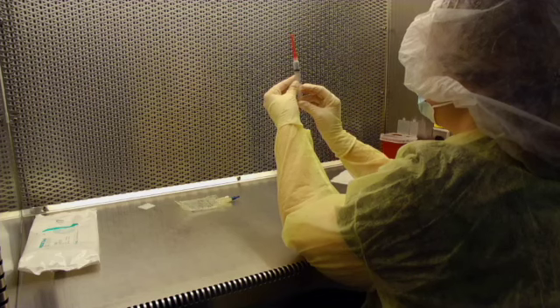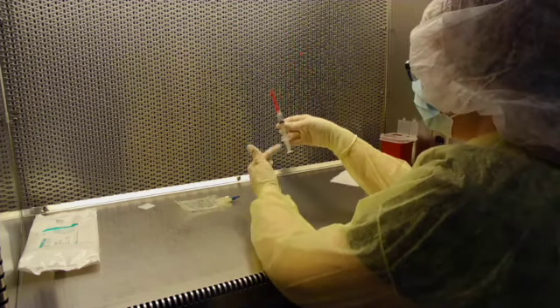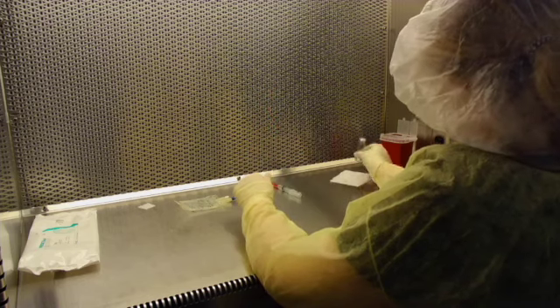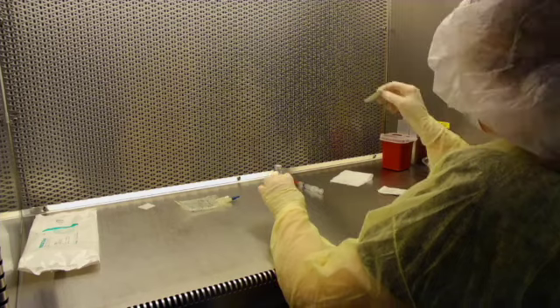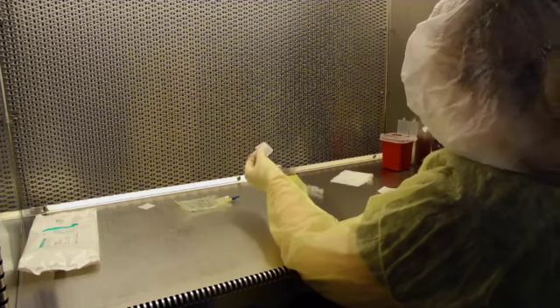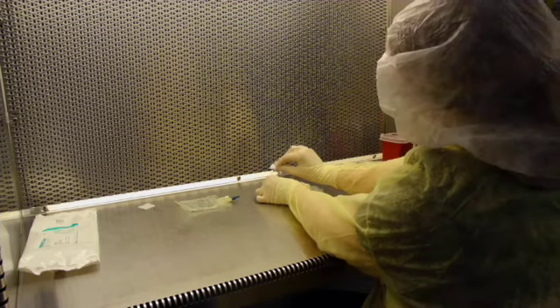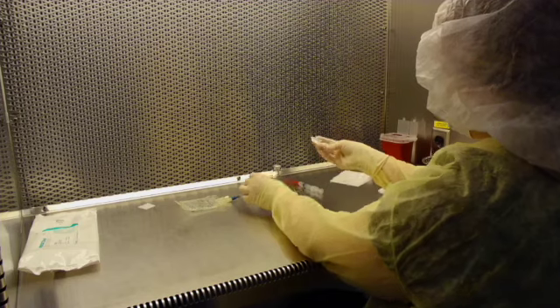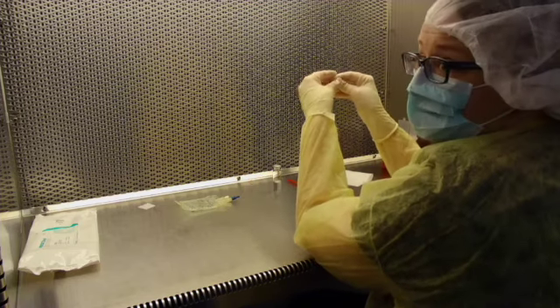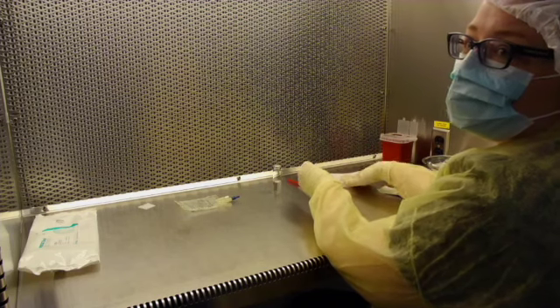Pull back air into the syringe equal to the volume you want to remove. Remember, you cannot touch the inner plunger of your syringe. Use a sterile alcohol swab to cleanse the rubber septum of your vial following the direction of your airflow 3 times. 2, 3, allowing 10 seconds to dry. Make sure you cleanse your finger after touching that dust wrapper.